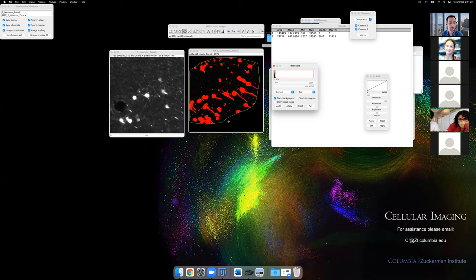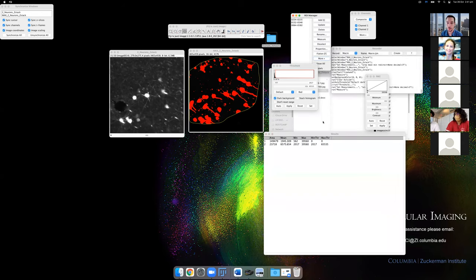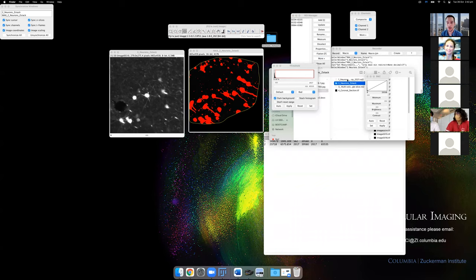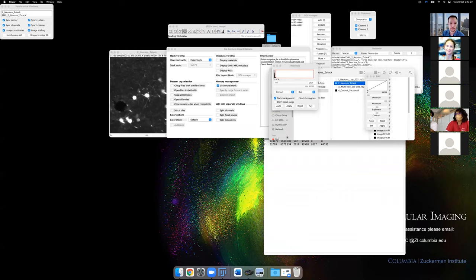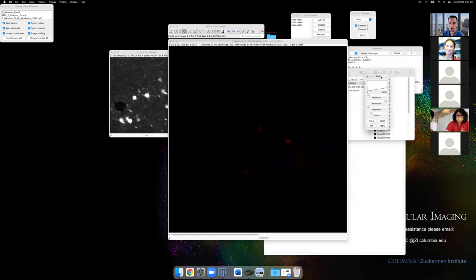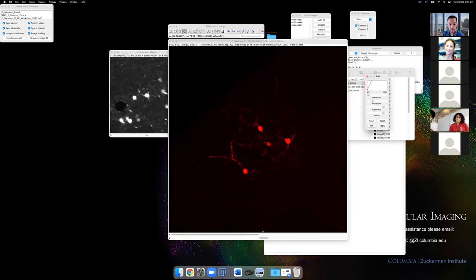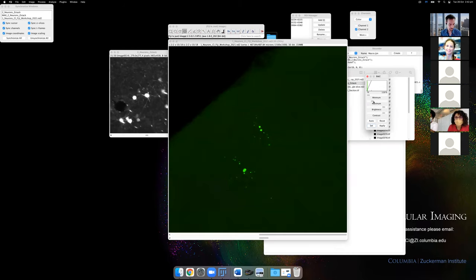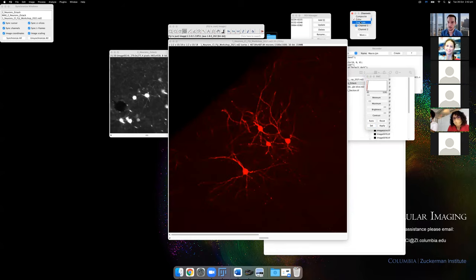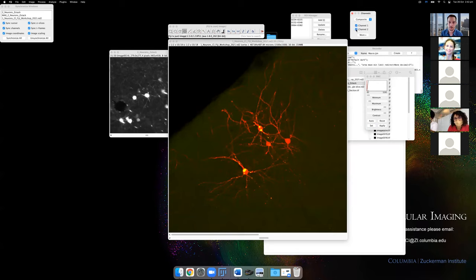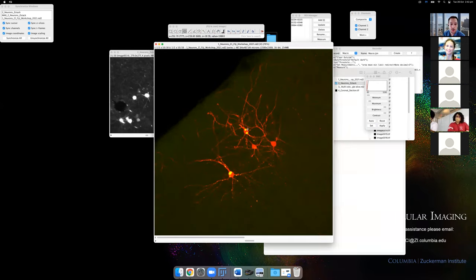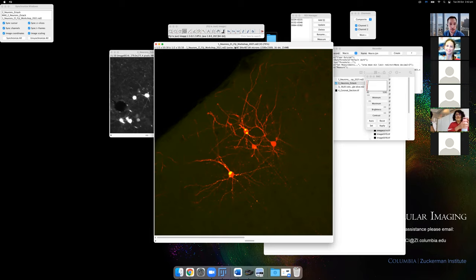Going back to the neurons image — this is an easy example where we can see where a protein is, but sometimes you need to show a profile of intensity. A good example is convincing someone a protein is on the membrane — you can show that using an intensity profile. First, duplicate the image with Cmd+Shift+D, which lets you test things without modifying the original data.